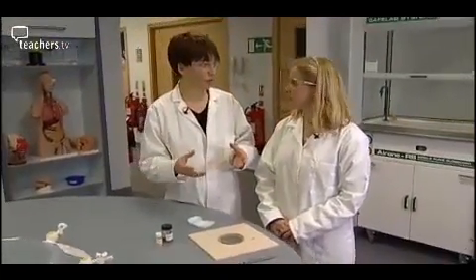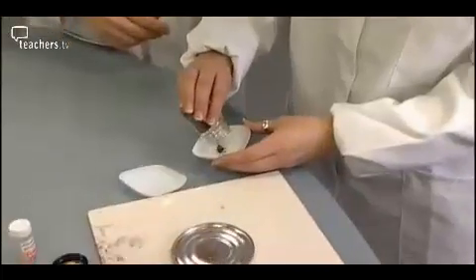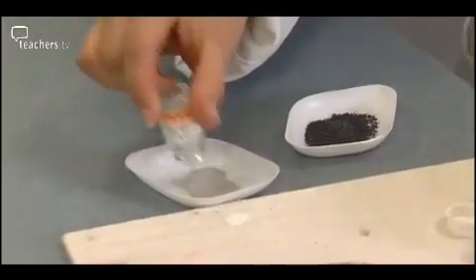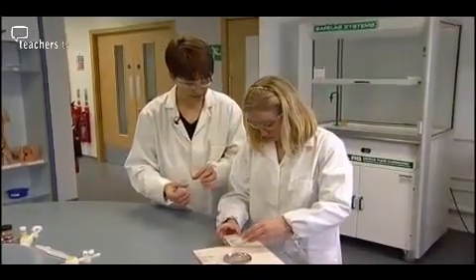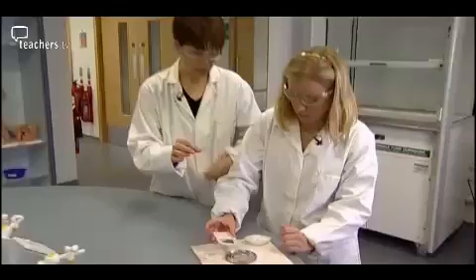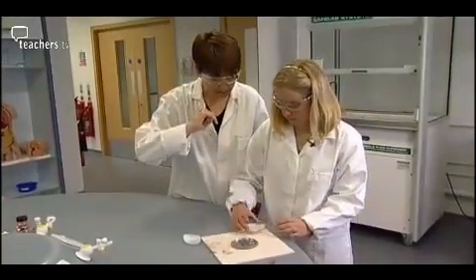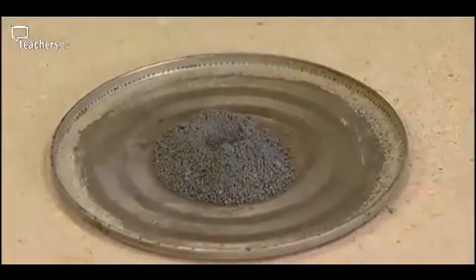This one is about two elements reacting together to form a compound. We've got some iodine and some aluminium powder. What we're going to do is mix the two together using the careful rolling method. The aluminium powder needs to be fresh, otherwise it will already be oxidised. As ever, gentle handling is advised to avoid a premature reaction. Then into the middle of the tin lid with a nice little heap, and make a small indentation in the top with a spatula because you're going to add a few drops of water. Then off to the fume cupboard.